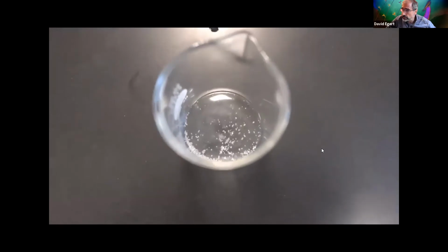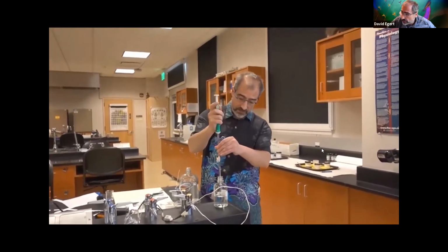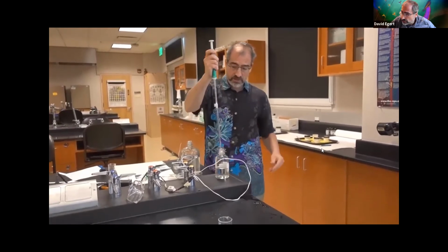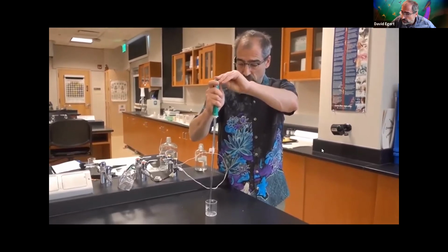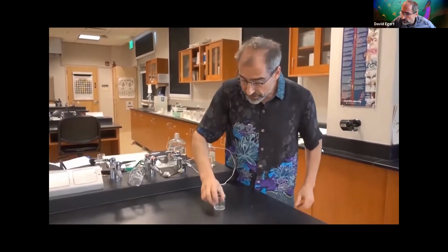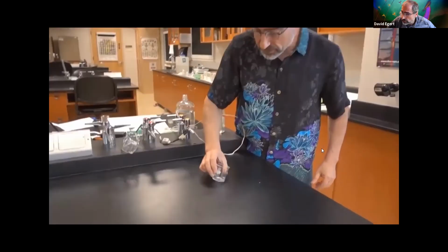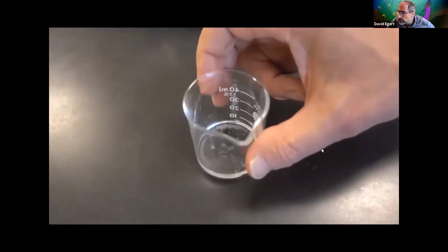And now I'm going to take the mineral oil, and I can take 5 mLs of mineral oil. In the same basic way, suck up to the 0. I now have 5 mLs in my tube, and then dispense. That's going to be 5 mLs of oil that are now in my beaker. And now I kind of mix it up. I don't know if you can see the crystals. I don't see the crystals dissolving. I just see a bunch of crystals lying in the oil there.